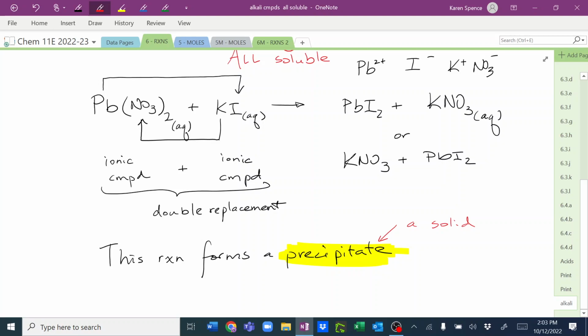Shall we watch it fall out? Shall we watch the precipitate fall out of solution? Are we ready? 5, 4, 3, 2. Whoa.